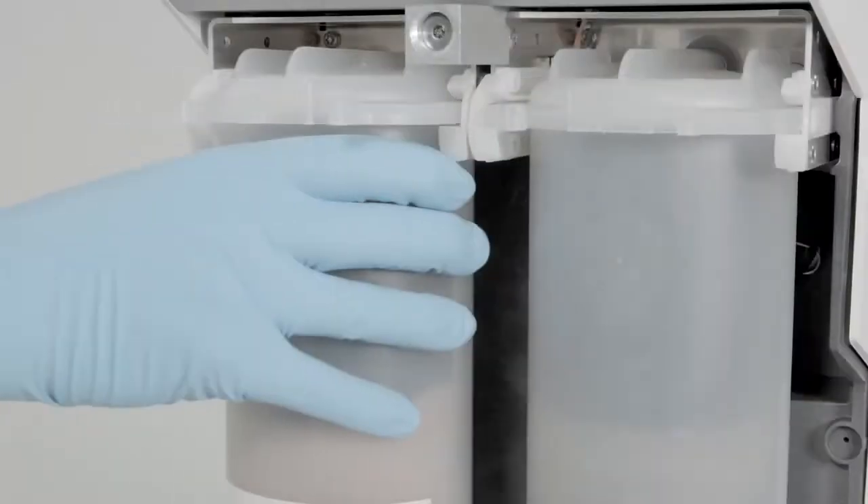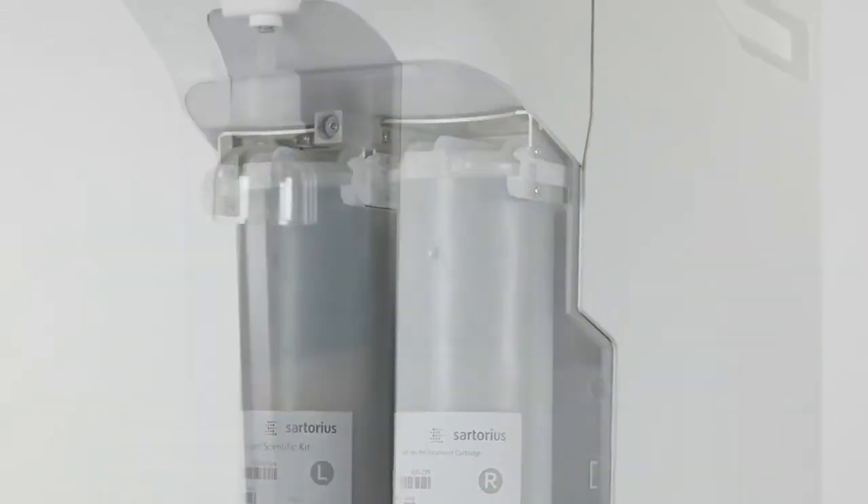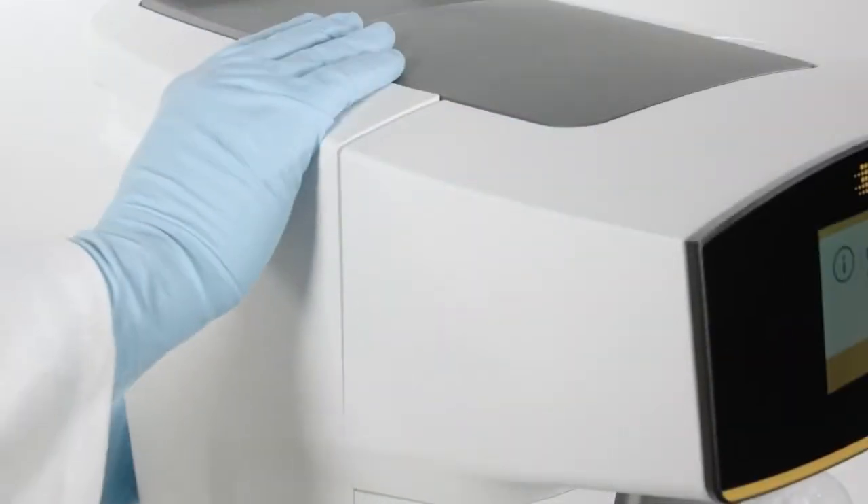The easy-to-install cartridges featuring high capacity save you time and money. When it is normally time to clean the tank, simply replace the bag in less than five minutes. Never use hazardous cleaning agents again.